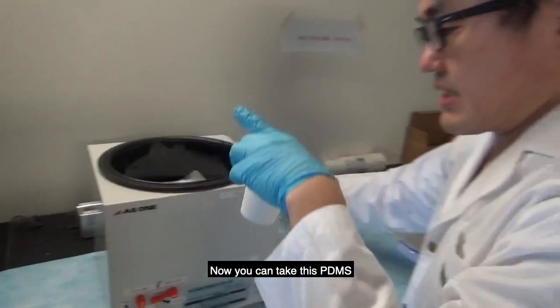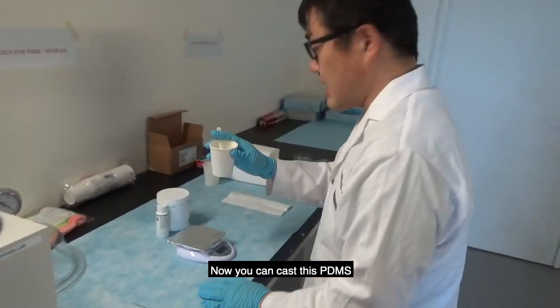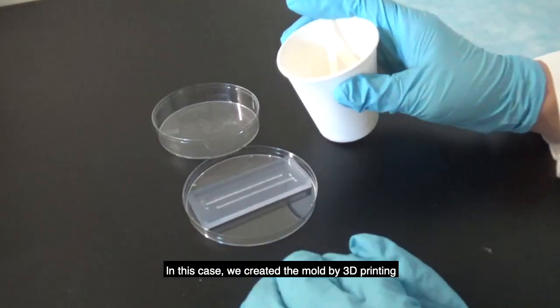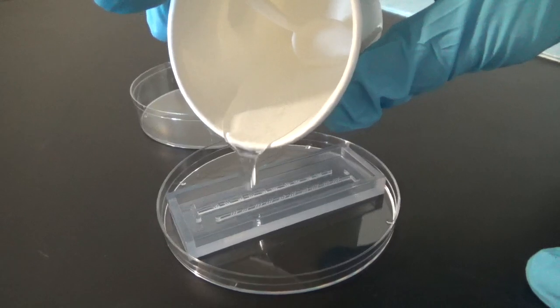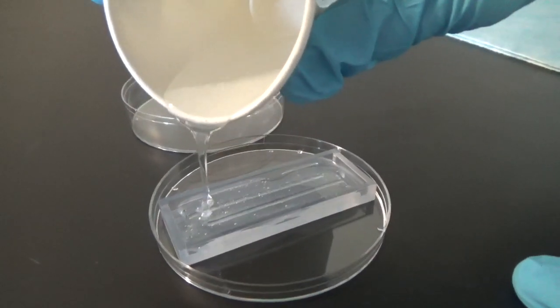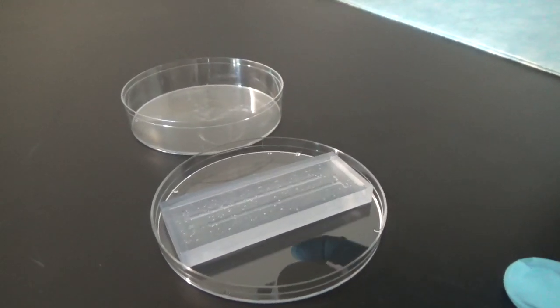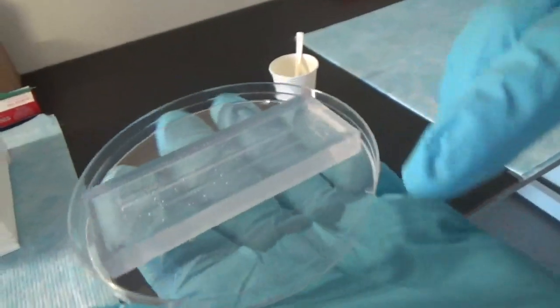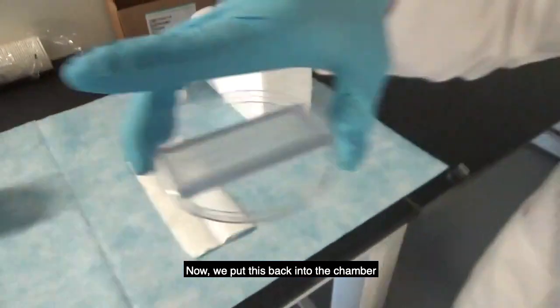Now take the PDMS — as you can see, most of the bubbles are gone. You can cast this PDMS onto the mold you created; in this case we created the mold by 3D printing. Simply pour it in. There may still be some bubbles remaining, but don't worry — we are going to degas again. Now the entire mold is filled with PDMS, so put it back into the chamber for a second degassing.